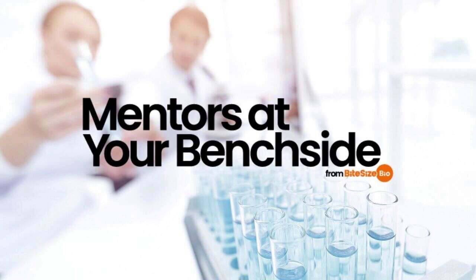When is Mander's colocalization coefficient recommended? When the biological question of your experiment concerns the extent that proteins and cellular structures overlap, MCC should be the measure of choice. These coefficients are more intuitively interpreted than PCCs and are independent of signal proportionality, differences in the number of structures labelled by each probe.